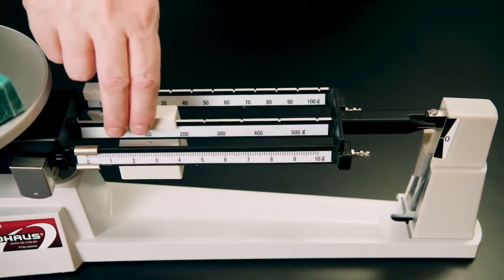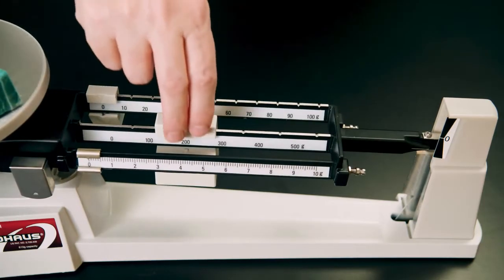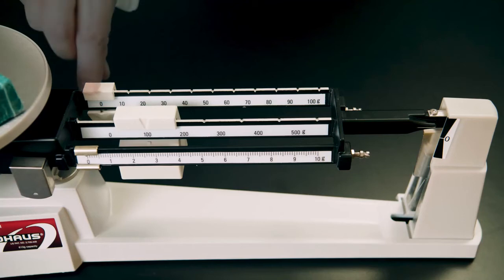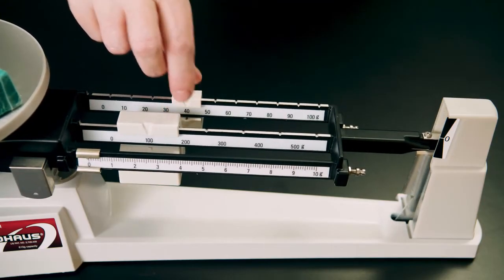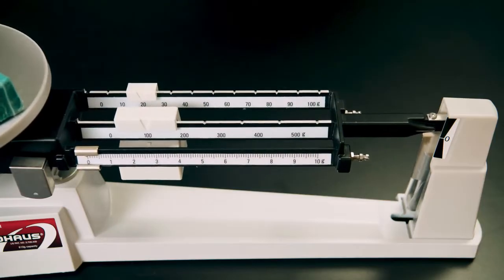Move it to the right until the pointer goes below the 0 value. Then move it back to the left 1 increment. Leave that mass in this position. Then move the mass on the beam that measures in the next greatest increment. Move it to the right until the pointer goes below the 0 value. Then move it back to the left 1 increment. Leave the mass in position.